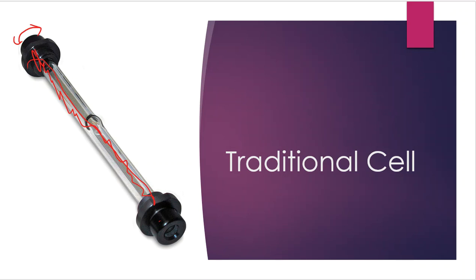You would want that little bubble on top, and then you would slide a little piece of glass over that extra to push out any of the air that might stay behind, and then you would screw this end piece back on. Then you would take the tube and flop it up and down, and you would not want to see any type of air bubble on the inside. If you had an air bubble, you had to add more and do it all over again. I mean, it was a mess.